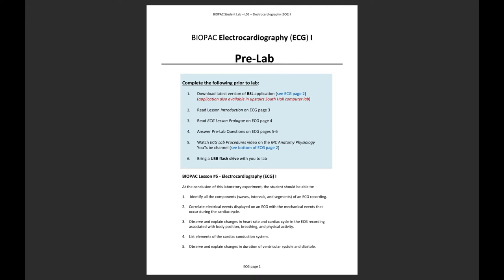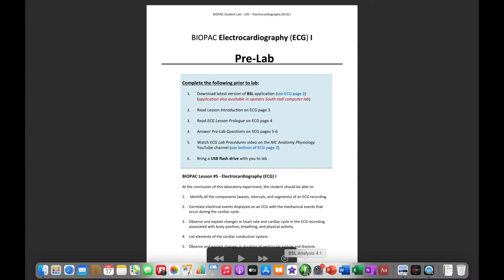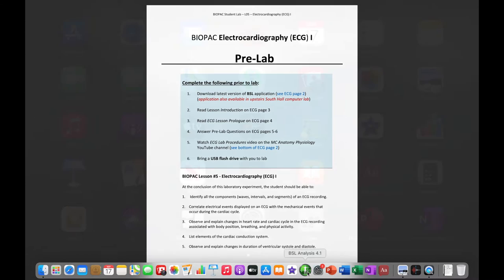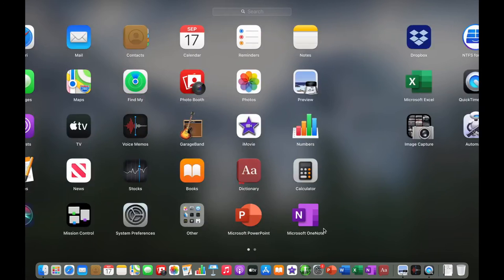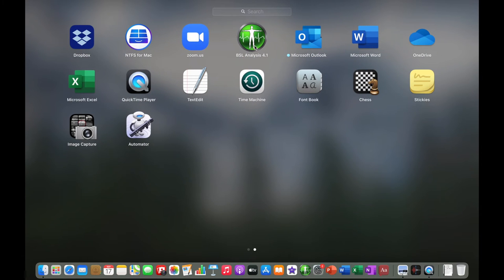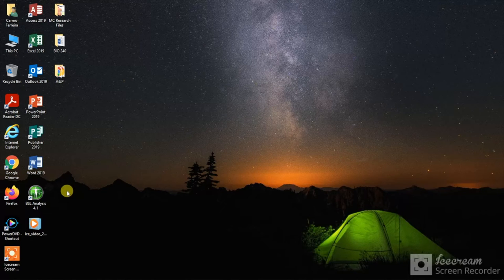Once the download of the Biopac application is complete, it may appear in different locations depending on your operating system. For Mac users, it may appear directly on your dock or in your F4 key options alongside all other applications on your system. For Windows users, this may download directly to your desktop or to your program files folder.